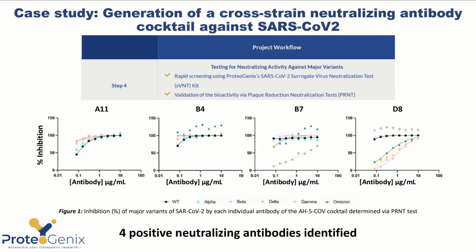The result showed a fantastic neutralization effect of the antibodies against all of the variants tested, with the inhibition of viral plaque formation here being plotted against the concentration of the antibody used, showing the great efficiency of our depletion, competitive elution, and cross-panning strategies to obtain neutralizing binders which are relevant in a therapeutic setting.